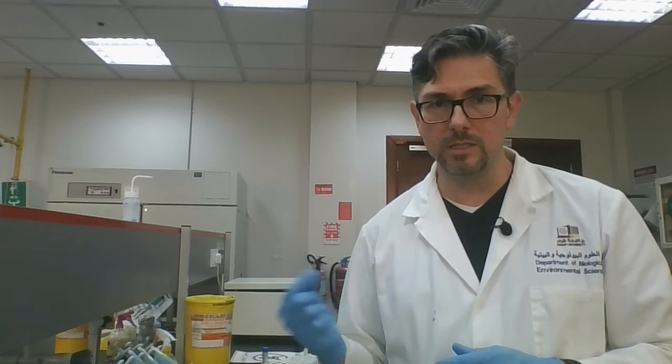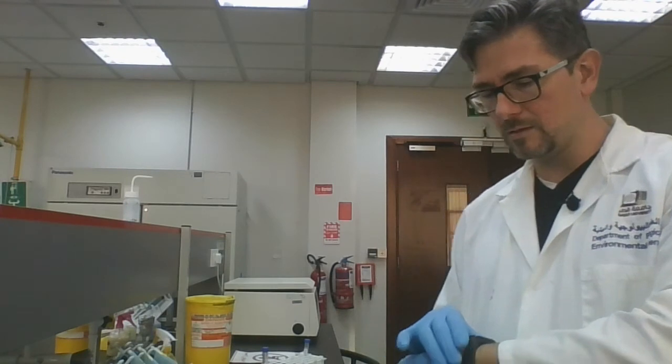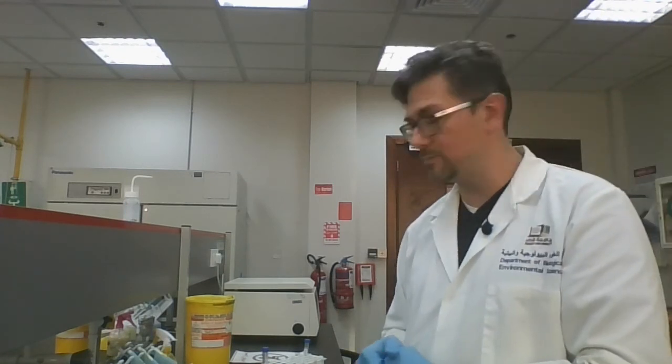We're going to have two solutions of TE that we're using at the end of the lab. One of them is TRIS-EDTA, or TE. The other one is TER. So that's going to be TRIS-EDTA plus RNase, which is the enzyme that's going to break down RNA. And so what we'll have in the end are two samples of plasmids. One of them will not have had any RNA removed, and one of them will. And so when we run them on a gel, you actually will be able to see the difference between those two samples after the electrophoresis, okay? So let's give it a couple more minutes and come back in a minute or so.